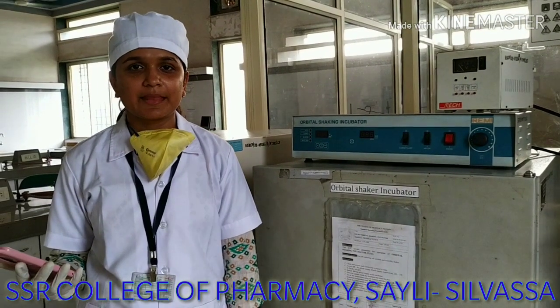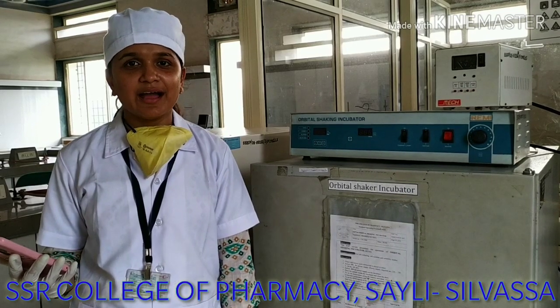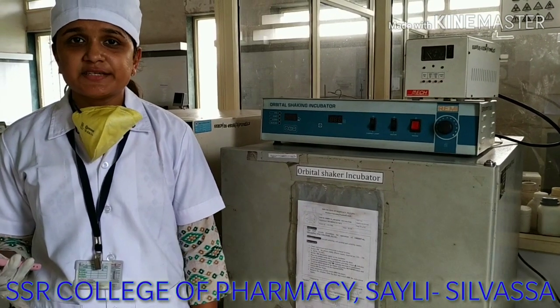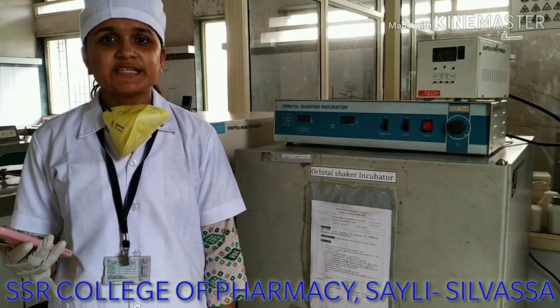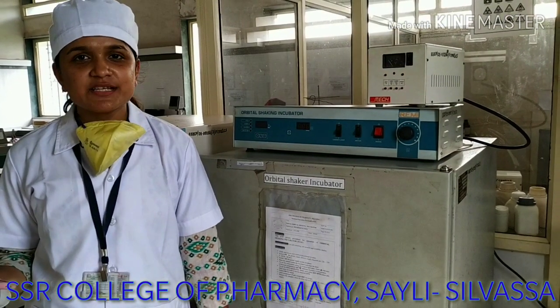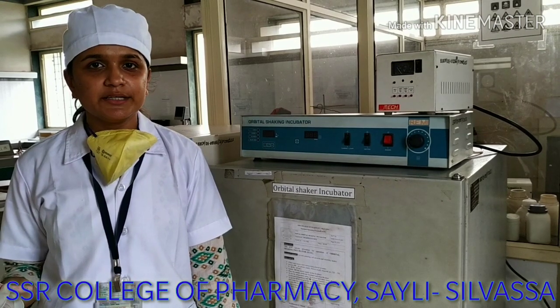depth is 78 cm, and height is 125 cm. The capacity of the sample holder is to hold 16 flasks with 500 ml capacity. The power supply needed for this instrument is 220 to 230 volts.